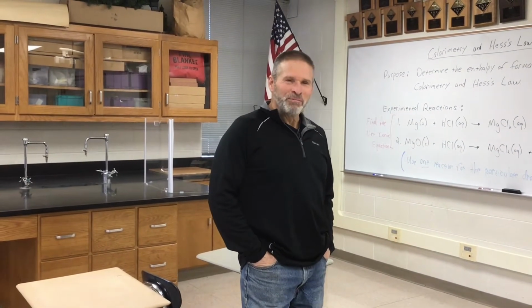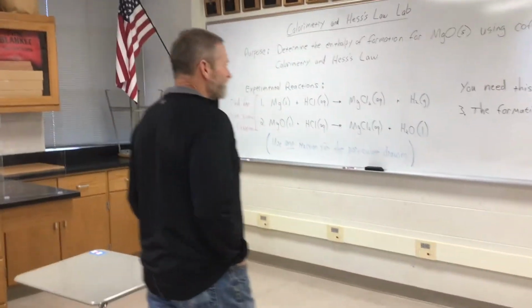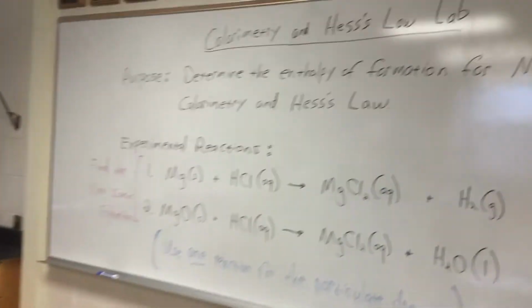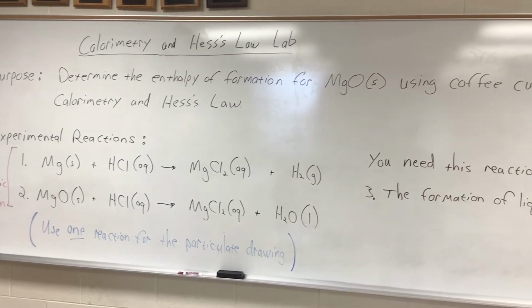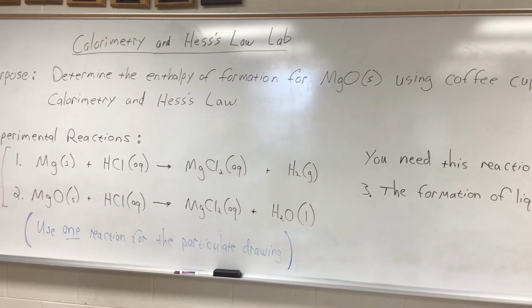Mr. Hevel, you have a calorimetry experiment for us today? We do, Mr. Moore. We have calorimetry galore here. Absolutely. So what we're doing here is coffee cup calorimetry and everybody's favorite, Hess's law. And here's what we're trying to accomplish. We're trying to determine the enthalpy of formation for solid magnesium oxide. That's your goal.